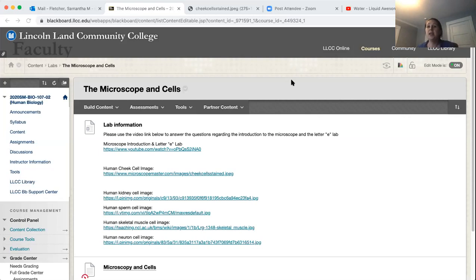Same with an organism. Now, there are some organisms we can see under the microscope. What kinds of organisms could we see under a microscope? An ant. An ant, yeah, maybe. An ant is still going to be pretty big, but we could probably see them underneath the lowest setting for sure. So small organisms we can see. We can also see single-celled organisms. Remember in chapter 1, if you've already started going through chapter 1, we talked about how all organisms are going to be multicellular or single-celled. We as humans are multicellular, but there are a lot of single-celled organisms that we can see underneath the microscope.